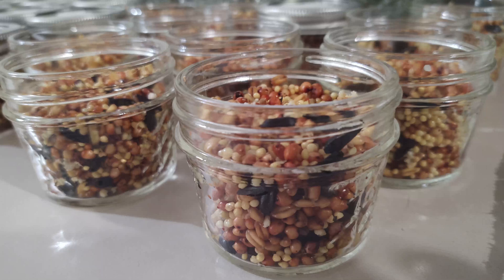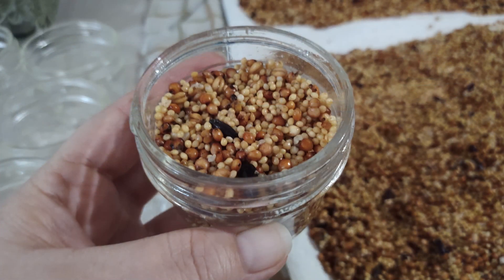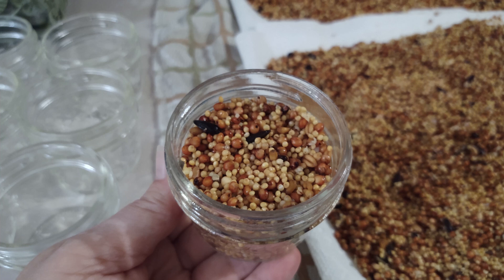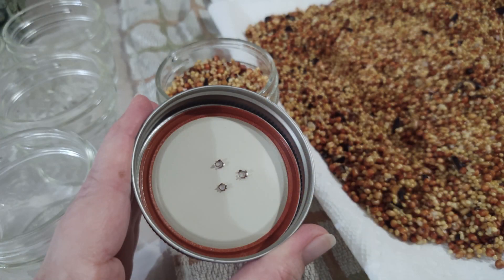In this video we're going to share our go-to way to cultivate mushrooms using wild bird seed or WBS for grain spawn. Sterilized grain spawn is an essential step in growing mushrooms. It's used to colonize substrates, enabling the mycelium to spread throughout. Mixing it evenly throughout the substrate allows for quick fruiting.